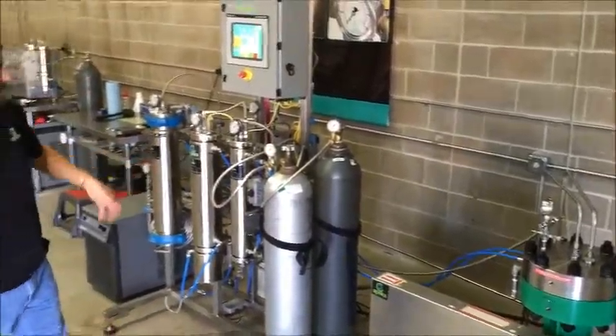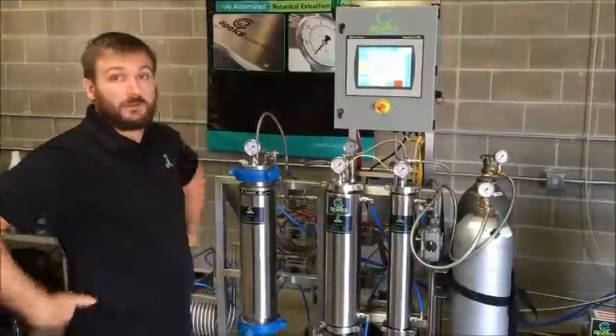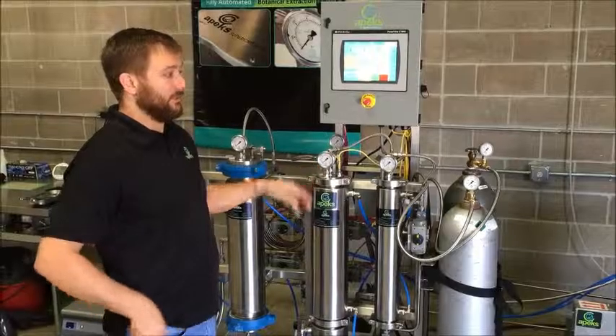Then we have our compressor. This system uses an electric 220-volt diaphragm compressor — very efficient and an extremely low-maintenance system.